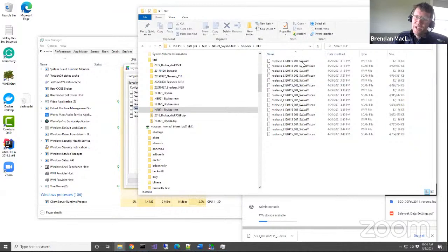That allows us to analyze this with DIA and ask which of these peptides are really consistently measurable. We want things that have low CVs, because if we want to do quantitative analysis, we'd like something that is measurable repeatably.